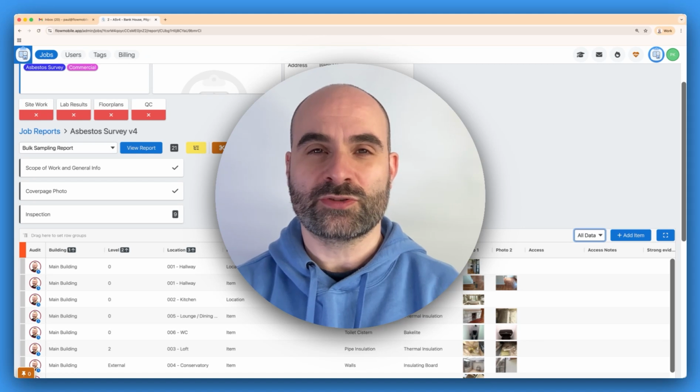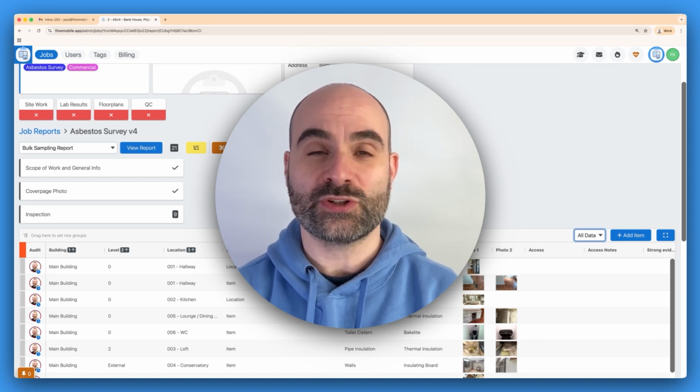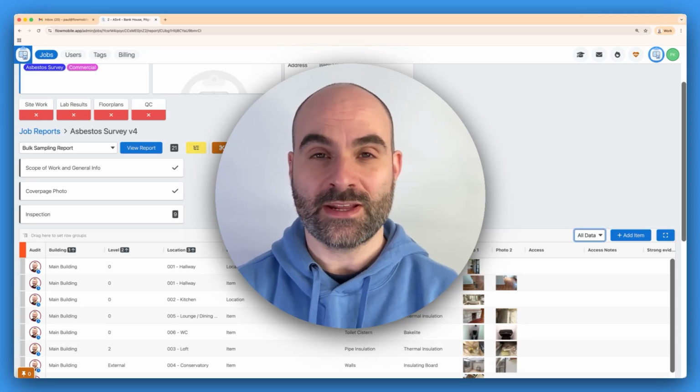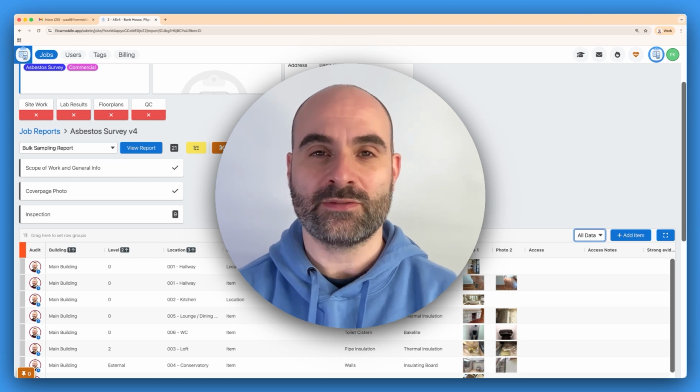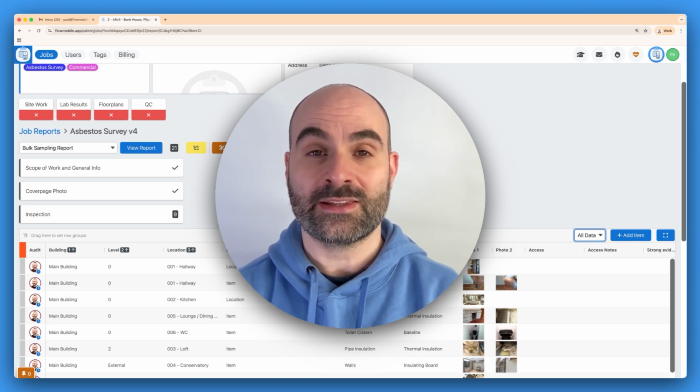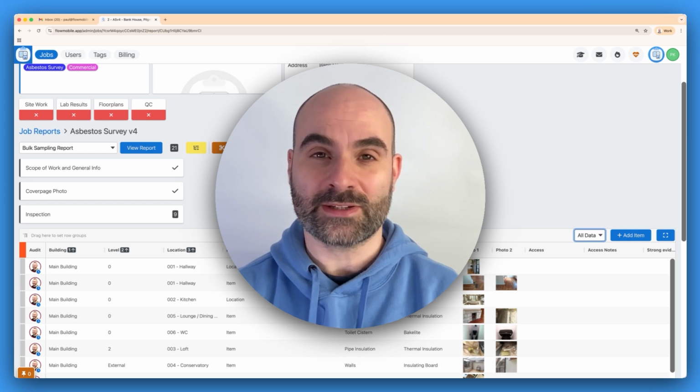During your quality control, you might find it helpful to pin specific columns. This is a great way to compare the thing that you're most interested in with everything else. It's kind of similar to how you have the freeze function on an Excel spreadsheet. So let's imagine I'm doing an asbestos survey. A key thing that I might want to compare things against is the sample ID.